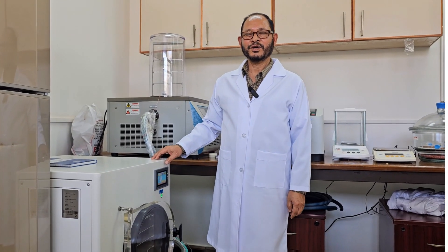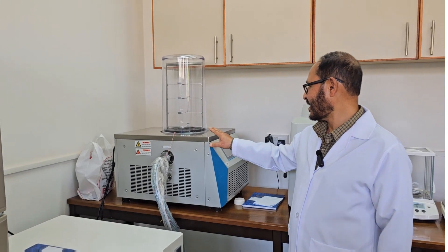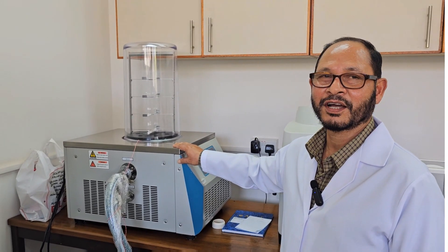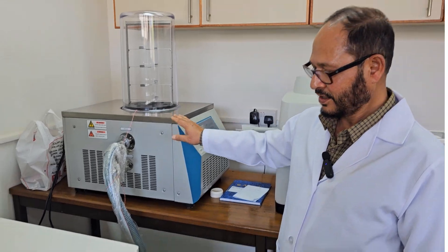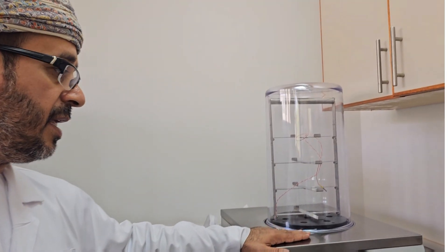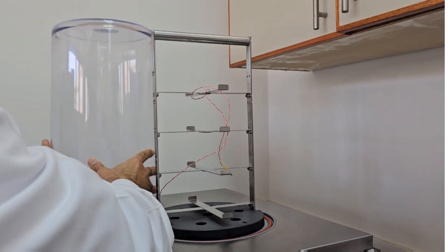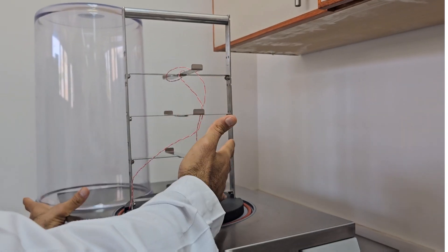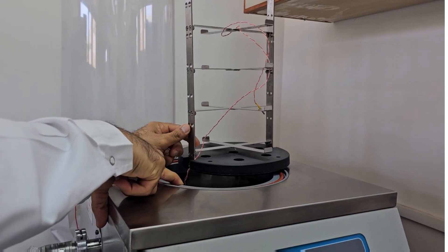Hello, today we are going to explain the freeze-drying process. We have two freeze-dryers. This one has only one stress processing, one temperature and one pressure. We have another freeze-dryer that operates at room temperature only, with a chamber where we put the sample and also a cold trap for the condenser.